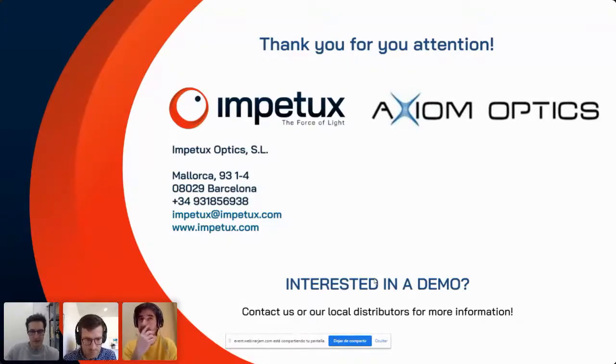So basically, there's no limit on what you can trap. In principle, you can trap anything which has a refractive index slightly larger than the medium where the particle is. But in general, to obtain a reasonably high optical force, we need a contrast in the refractive index. Typically, if you are in water, the particle should have a refractive index of at least 1.4, similar to a cell, 1.378. From there, we can start trapping things.